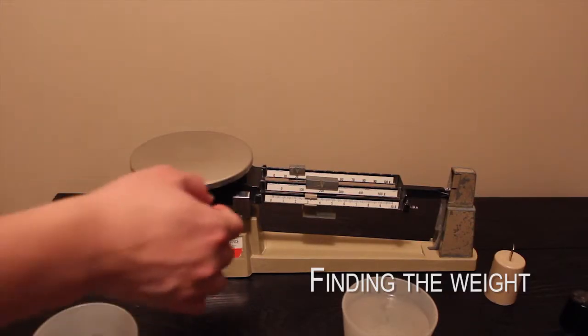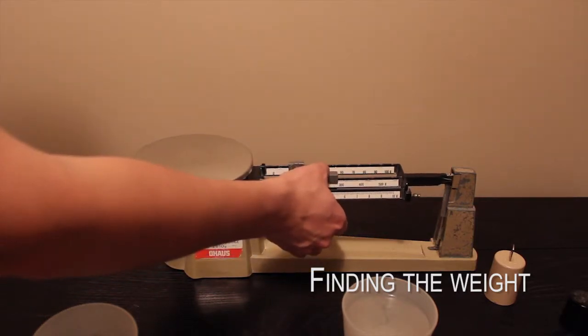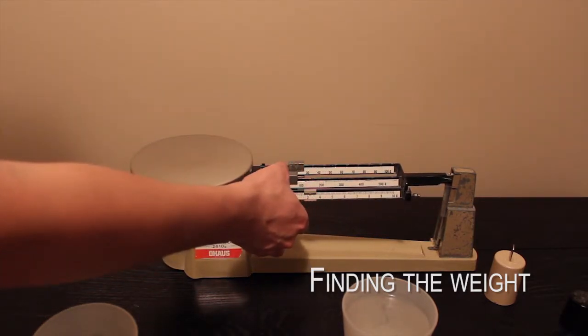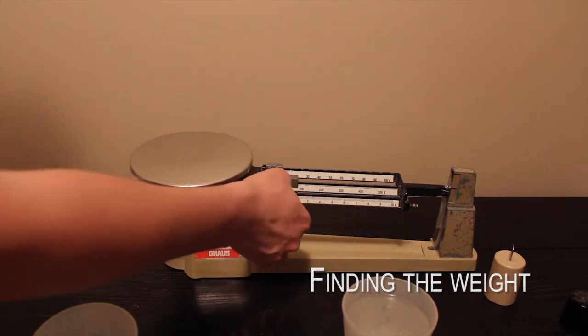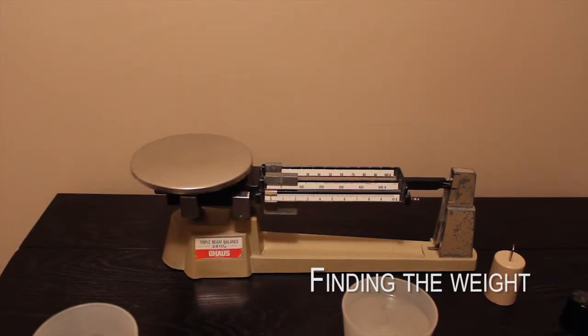Demonstrating an example, we will measure how much the cup of water weighs. The first thing is to move all weights to the left to zero out the scale. The balance pointer will reach the middle point.